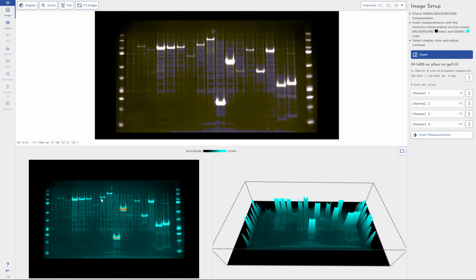Obviously, the changes would ideally, theoretically, be relative. So quantifying an earlier time point shouldn't really lose you any information. What you may lose is a certain sensitivity on the bottom end. And that's kind of a bigger issue that I'm not going to go into on this video.